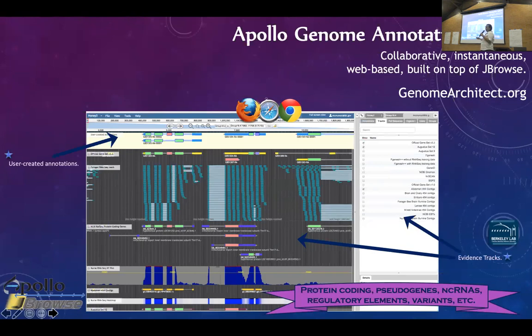It's just because I decided when I was configuring this that the gene models would have the UTRs look yellow when they are sitting down on the evidence tracks, and they will look light blue once they are actual annotations that I'm modifying. So they contain the same information, but they are two different entities, because this entity becomes the one that I'm modifying, and it will be ultimately the new corrected gene model that I am going to work with.